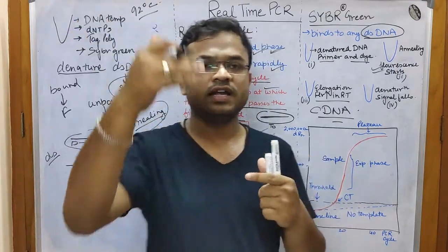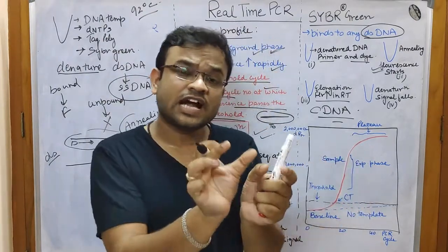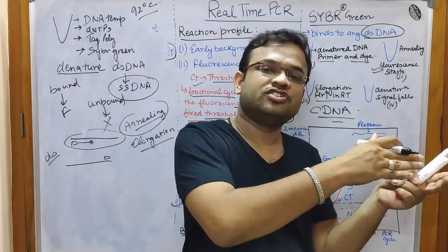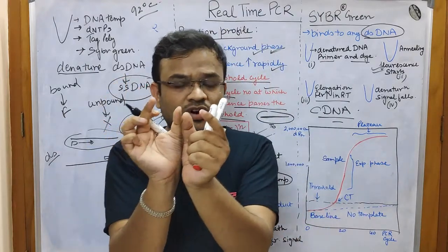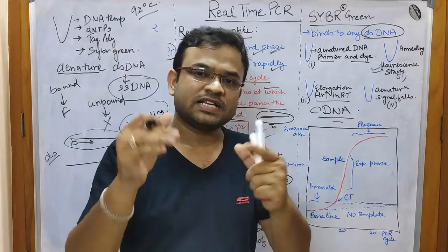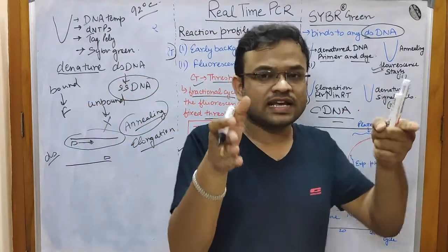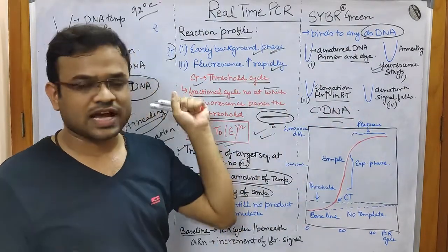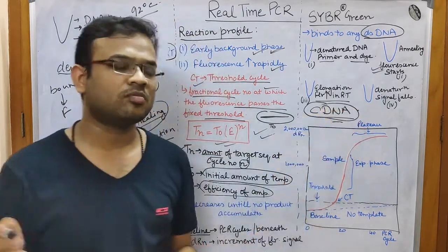mRNA is the RNA that has been produced in a particular tissue because it needed particular genes to express. Now that mRNA has been changed into cDNA, we have the complete information of the genes that were about to express in a particular organ. We have the information in the form of cDNA. So everything that I have told you, we are working on cDNA. Please do not confuse it with the normal DNA.